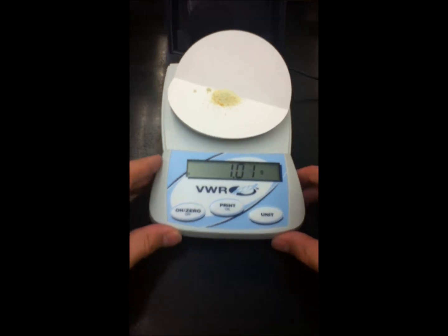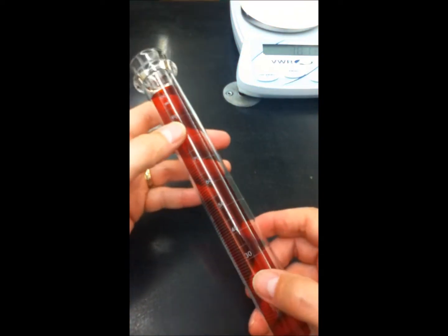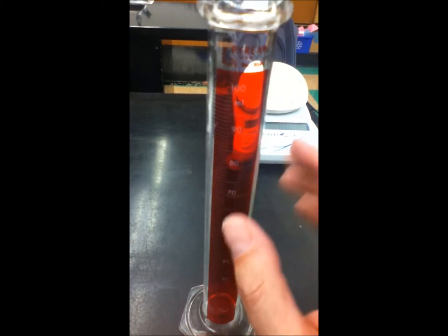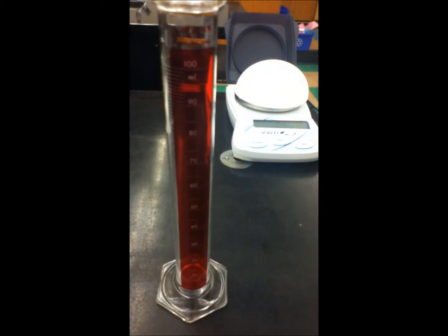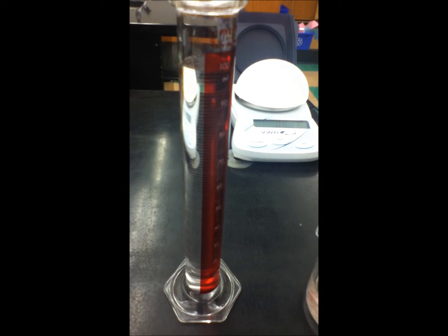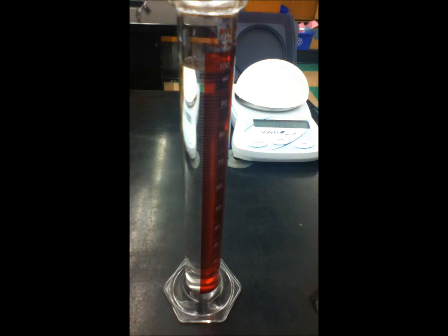Now we're going to measure using a graduated cylinder 100 milliliters and put it into a 250 milliliter flask. Typically when you're doing something like this, you want the water level to be at the 100 milliliter mark. What you'll get is what's called a meniscus — a little arch of water — and you want the bottom of that meniscus to be at the 100 mil mark. That's pretty good; the bottom of the meniscus is right at the 100 mil mark.